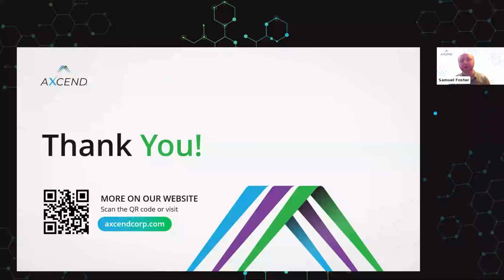I see another question here. Are there practical differences I've seen between face sealing fittings and traditional ferrule-based fittings when switching columns frequently? It's a rare but not impossible occurrence that these face sealing fittings, because you are deforming a material over and over again, can get visibly deformed or visibly a little bit messed up on the end of the face sealing fitting. When you're swapping columns every day, 5, 10 columns a day, it can run into some difficulties there.